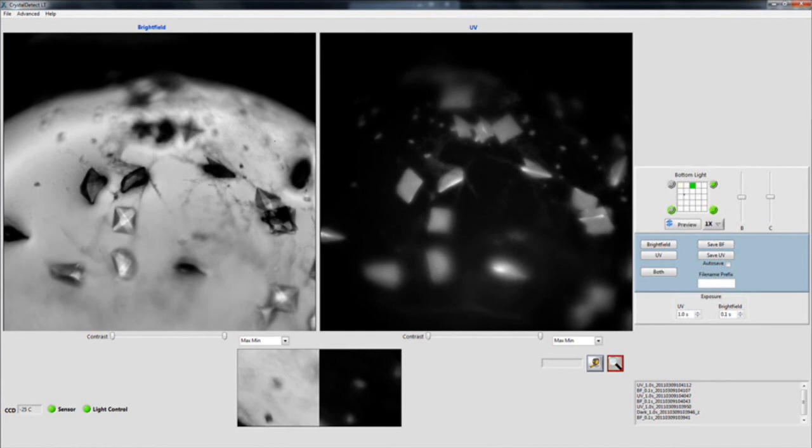Here is the simpler version, which is the light version. Pretty much the same everywhere except for the map configuration.